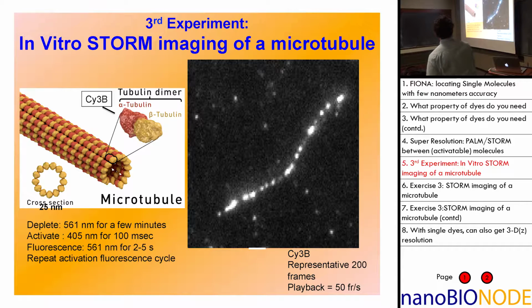I was just thinking trial and error. I actually have no idea how mathematically. Experimentally, I would just do the same thing you said with the coding and stuff like that in our lab. So just get a bunch of these. And then you're not even measuring the location of anything, you're simply exciting these fluorophores.